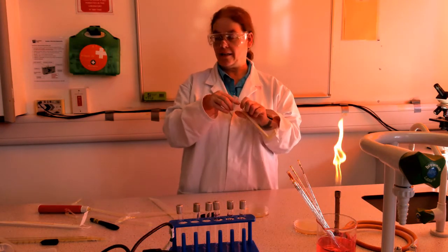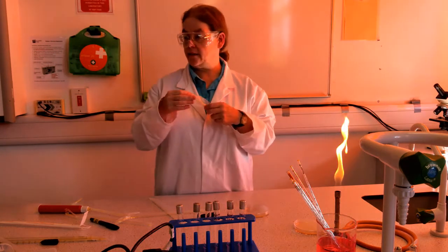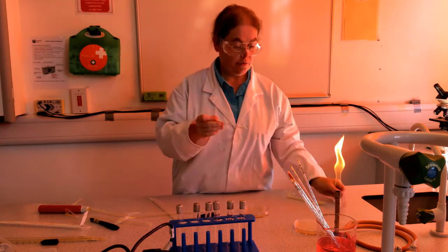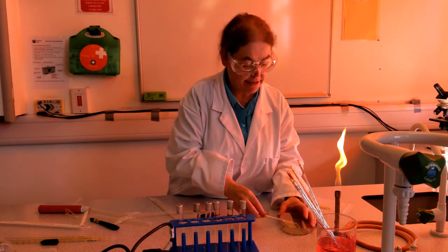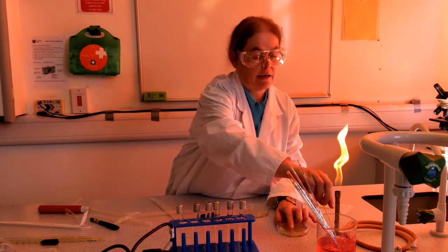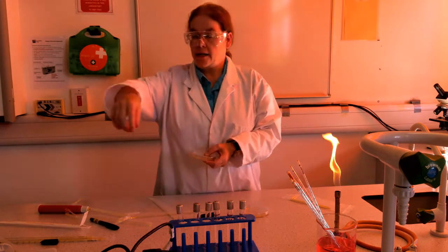I know I'm slightly behind the Bunsen burner here, but I've demonstrated this method already, so you're familiar with the idea of spreading a plate. Make sure I get in all the corners. Okay, I will sellotape that up, two sides.